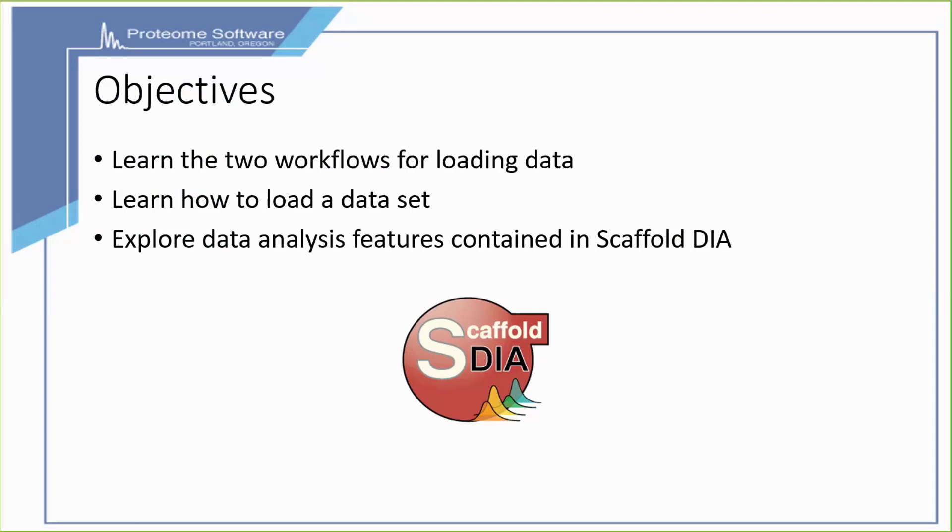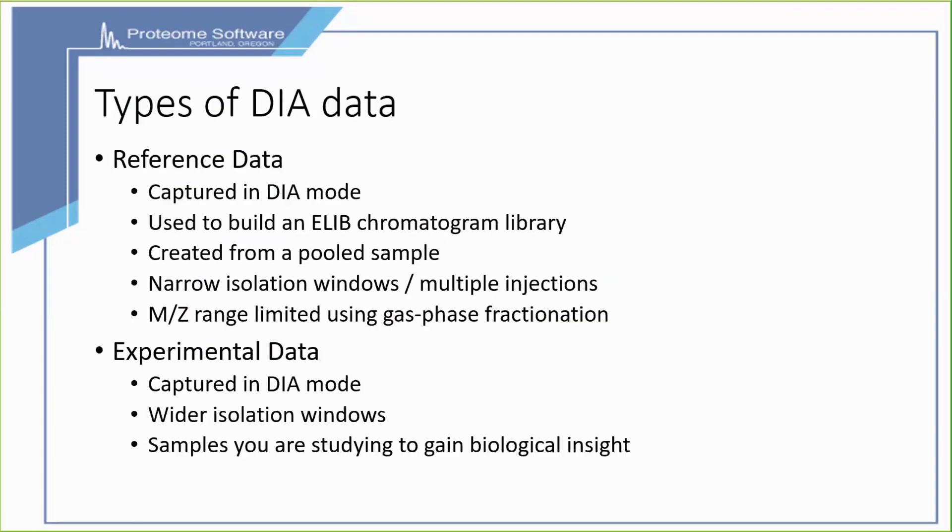The objectives for this portion are to learn about the two workflows for loading data, learn how to load a data set, and explore some of the data analysis features contained within Scaffold DIA.